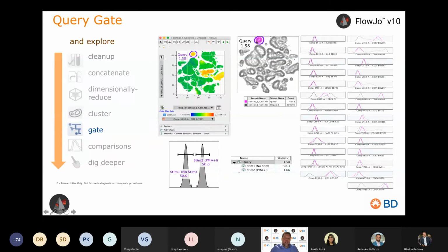So in this case, this population, which you can clearly see is a CCR7 expressing CD8 cell with some CD28 on it, and some high for CD27, is predominantly represented in the unstimulated condition. So that means that when I stimulate these cells, they disappear, right? They go away. Almost all of them are gone because they've acquired new phenotypic properties.